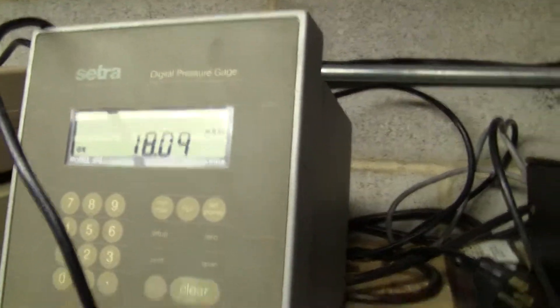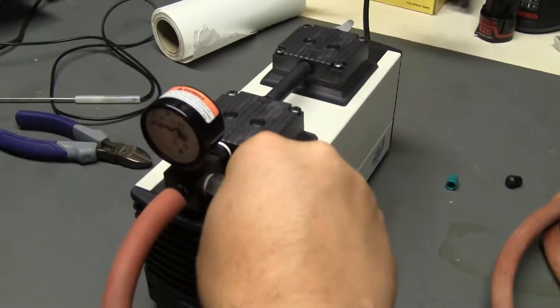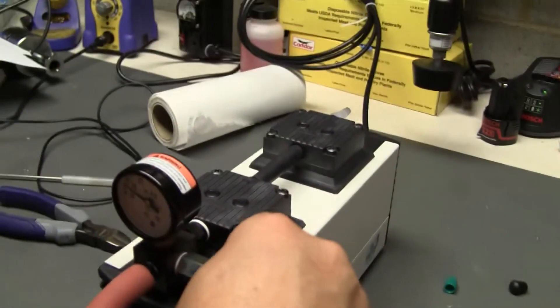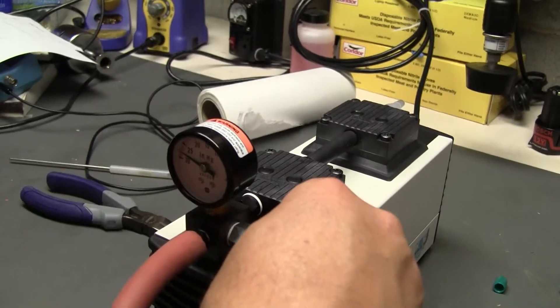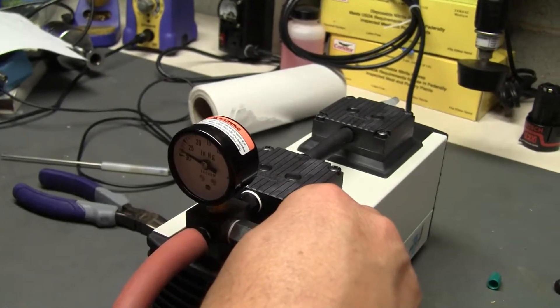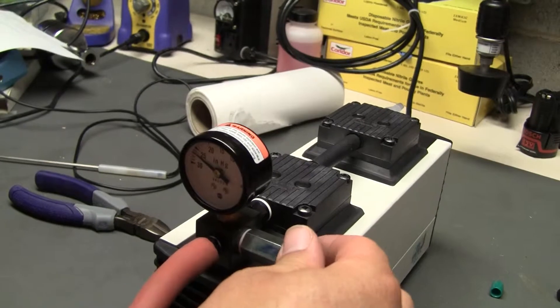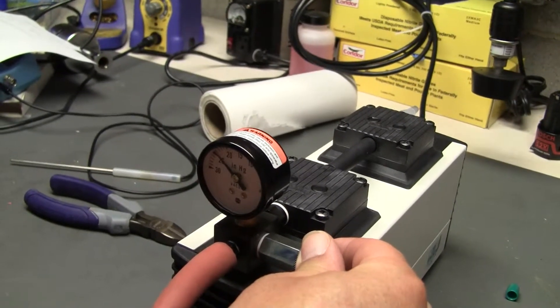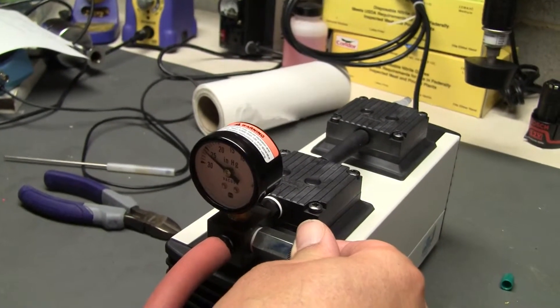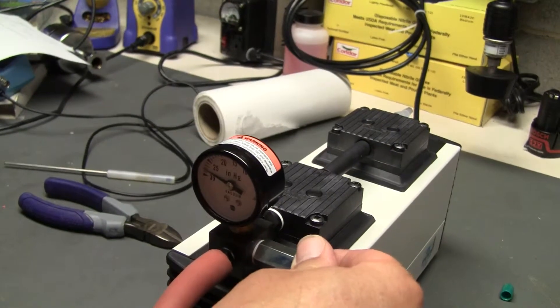Once again, it has this nice little adjustable gauge on it, which is nice. Gauge is actually in inches of mercury. If you have any further questions, please don't hesitate to call 609-518-9100.